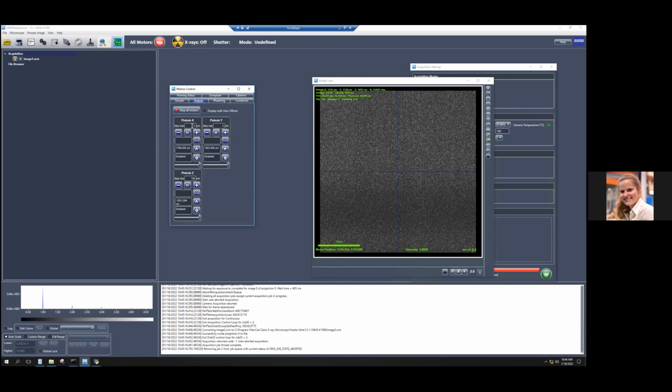It might be a little too little, so it might be that the bright spot dims but doesn't completely go away. So go another 2 microns. And it might be a combination of X and Y as well. Yeah. If you bump the pinhole a lot, it'll just be dark. And then you just call me in.